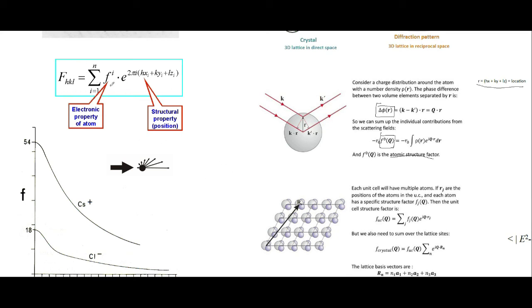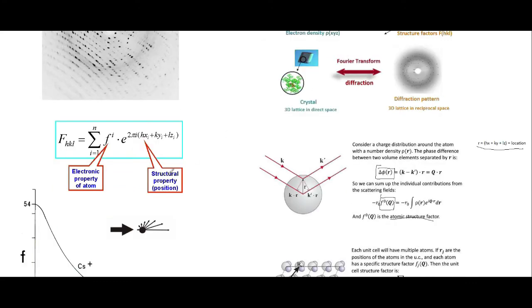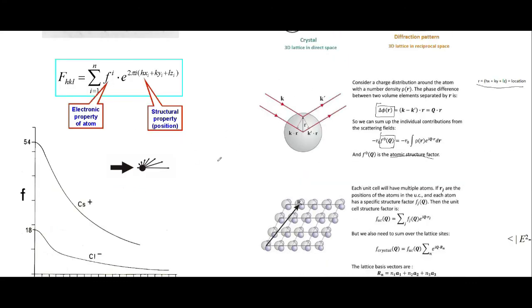And so that is seen in the intensity of these spots, and then we also want the position of them.